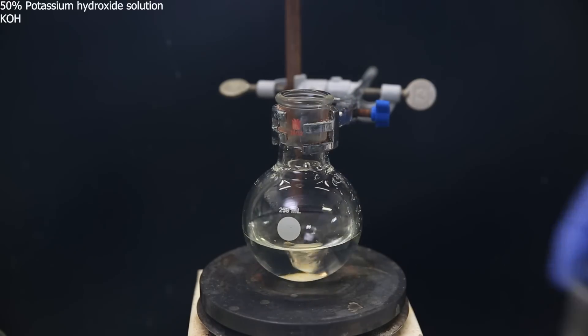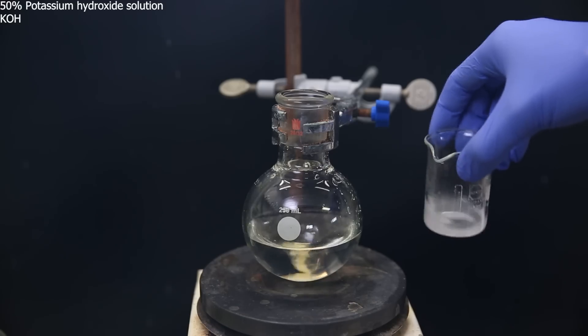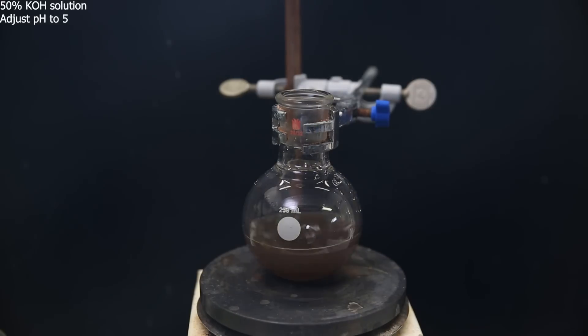When that happens, I prepare a 50% potassium hydroxide solution and use that to adjust the pH of the solution to about 5, to make sure that enough of the acid is deprotonated and that the nitrate ion fucks off to form potassium nitrate instead. So I dropwise add the potassium hydroxide solution to the flask and constantly check the pH to make sure I don't overshoot.